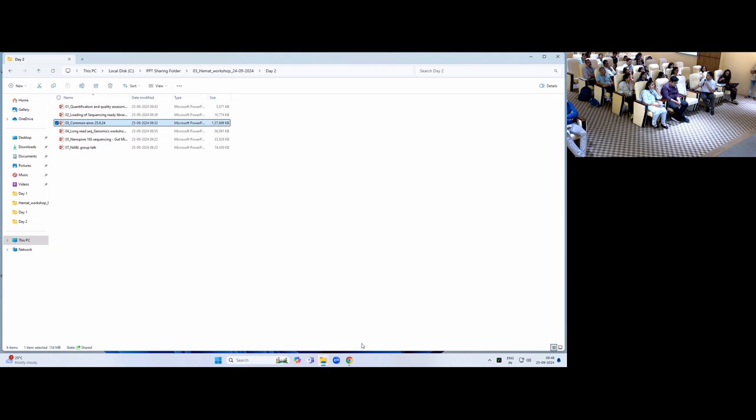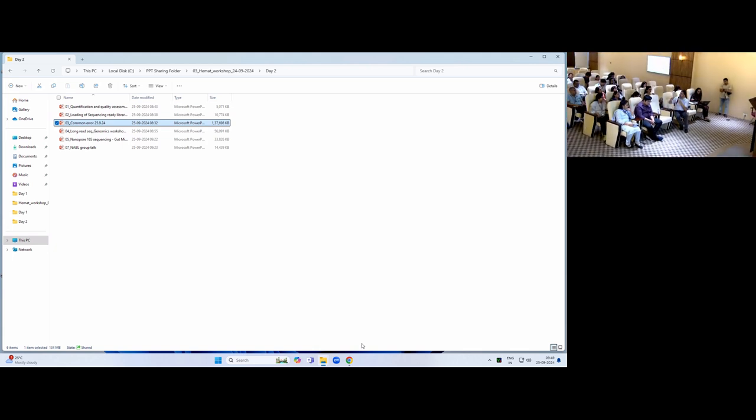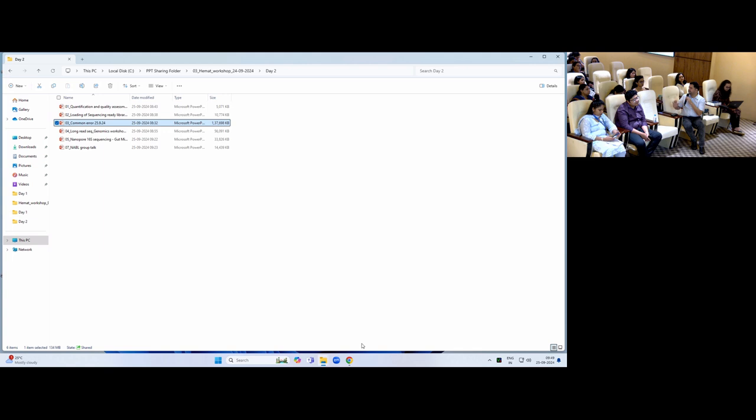It has its advantages in the sense that you can get even better cluster generation, even better quality metrics as compared to standard Illumina libraries. But once again, 99% of people will not need to do custom sequencing stuff.